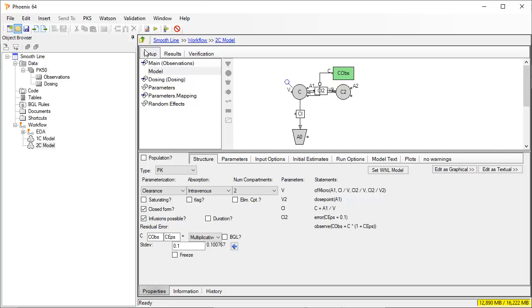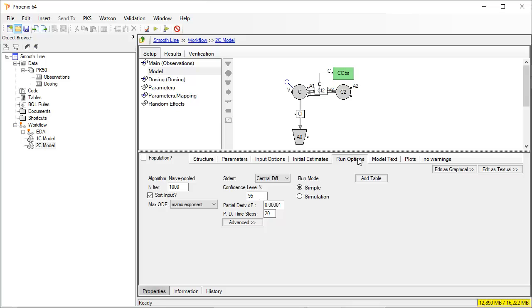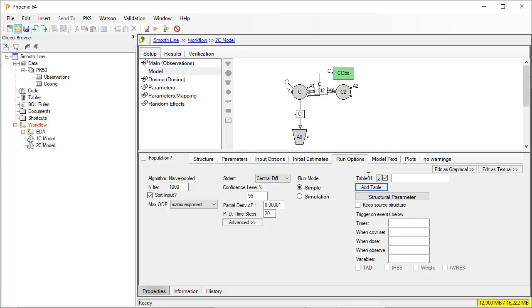Now we click on the Run Options tab below and select Add Table. A table requests an additional worksheet in the output. In our case, we want many time points of the prediction.